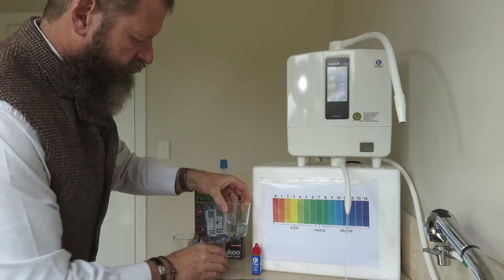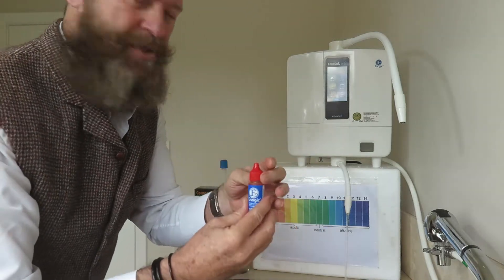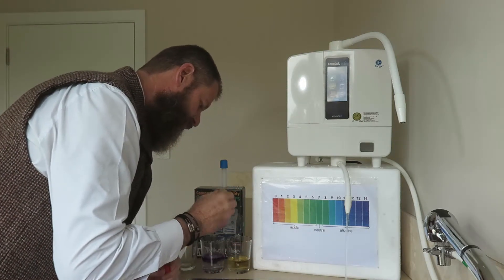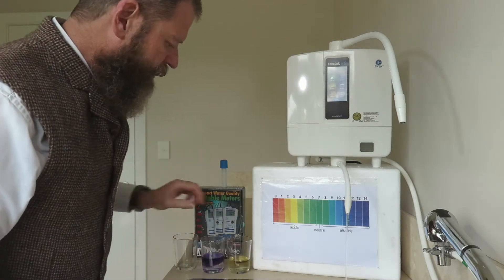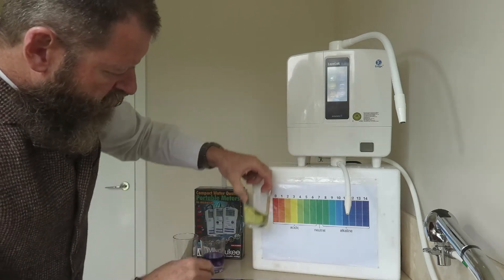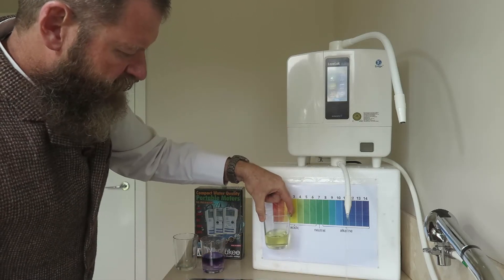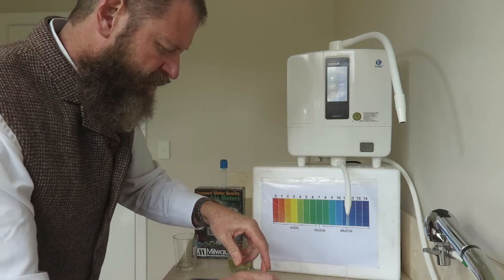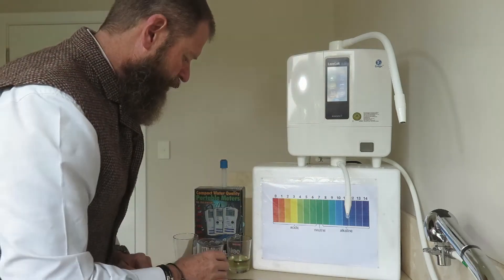I'm going to be using my Enagic pH drops just to give you a clear indication of the alkalinity and the acidity. Over here we're looking at a strong 2.5 — that's 2.5 acidic — and over here we're looking at 11.5. Alright, 11.5.